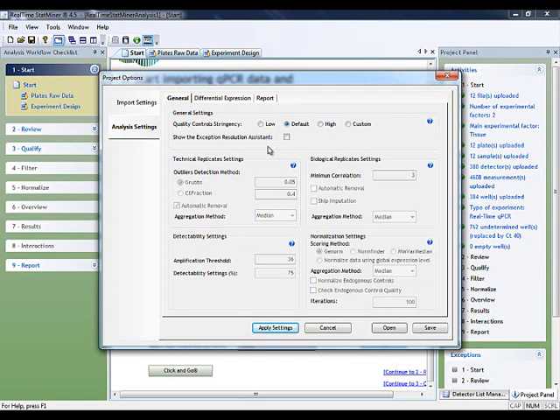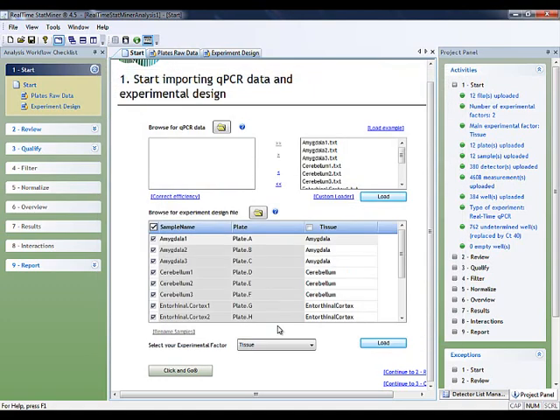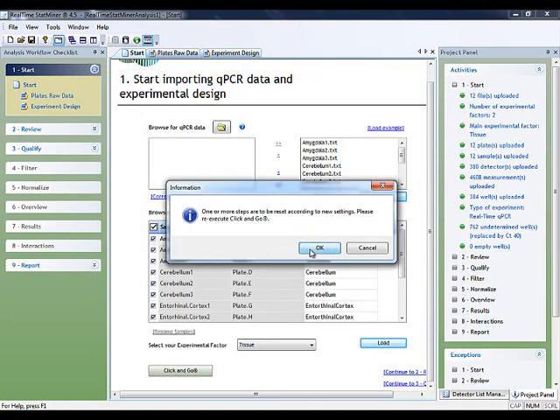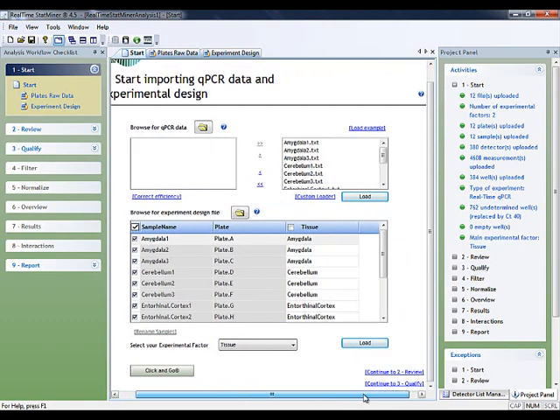This configuration tool provides several levels of stringency, including a custom quality controls configuration, but in this example we are going to perform our analysis with the default settings proposed by StatMiner. We are now defining a control group from the Differential Expression tab. We are ready and now have 2 options to run the analysis.